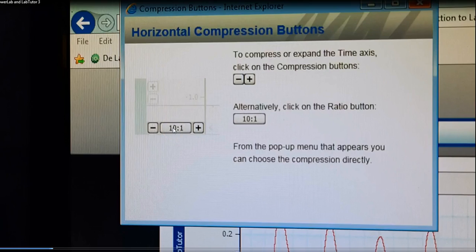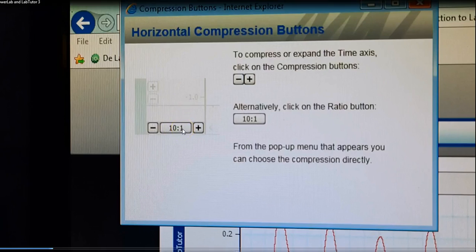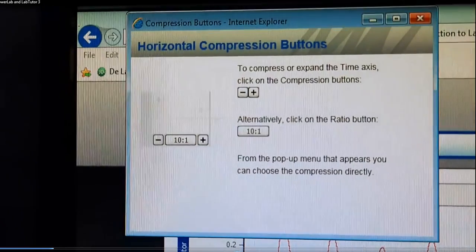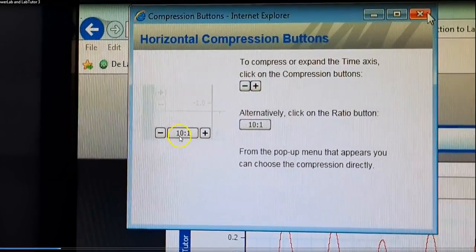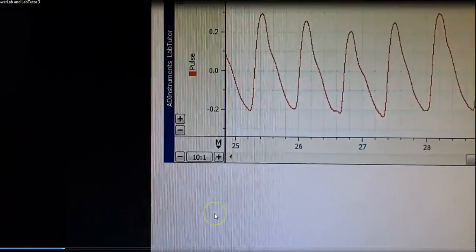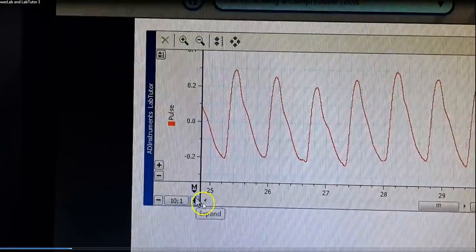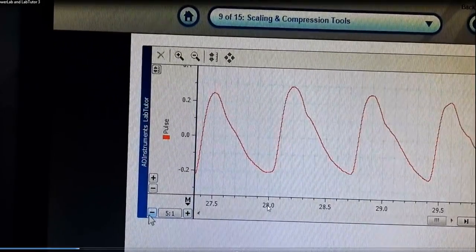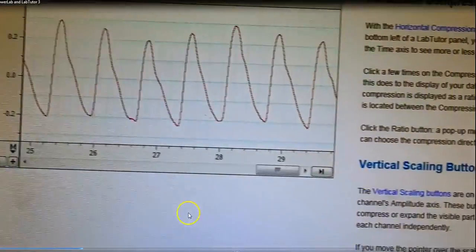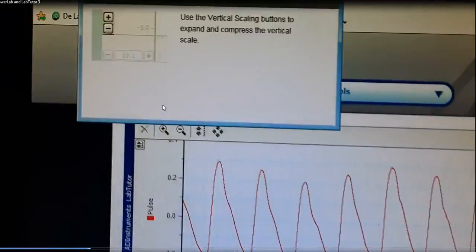That will immediately give you a defined vertical and horizontal proportion of your waveform. By clicking positive, we get it faster, and then narrower. As you can see, as the waveform is adjusting, the scale is also moving together.